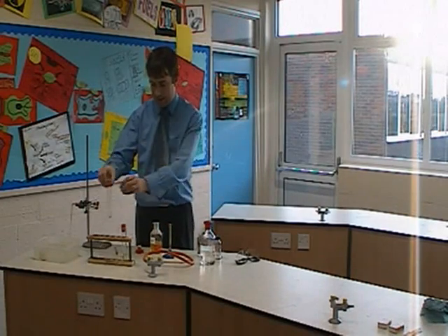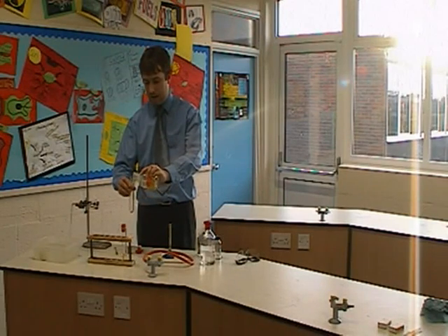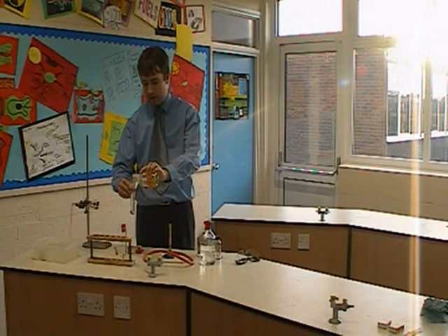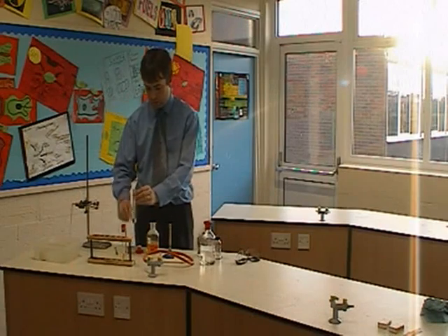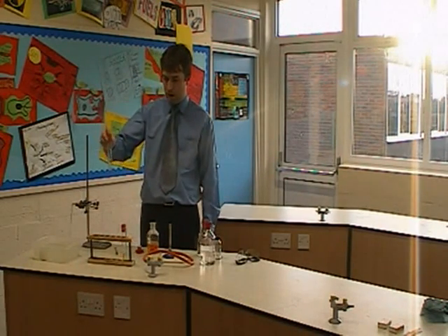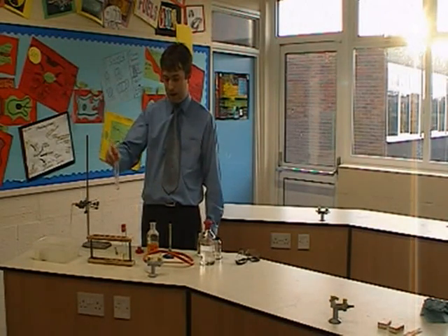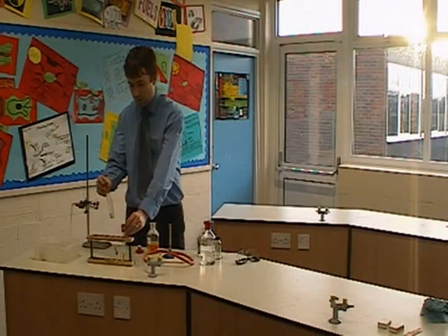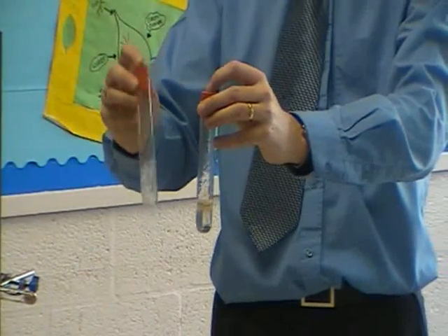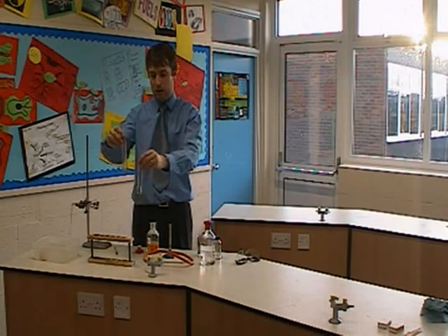If I pour some bromine water into the tube of gas that I've produced, what we should find is that when I shake up the bromine water and mix it with the gas, the liquid should actually go colourless. And that's proving to me that we've produced an alkene in the experiment. You can see quite clearly the difference in colour — it's gone from being a yellowy colour to a clear colour.